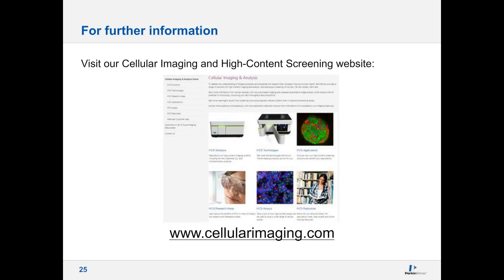Thanks, Christina. This is Joe Trask speaking, and I'll take that question on. I'd first like to say that at last week's SBI2 meeting, Society for Biomolecular Imaging and Informatics meeting in Boston, there was a 3D colloquium to really talk about some of the challenges with 3D imaging. Of course, as Jakob pointed out, light is the main thing. So getting good light penetration into the tissue so we can actually detect it is a challenge. And so it really comes down to the size of the spheroids or the tissue that you may be looking at, and how far light can penetrate into the tissue and then be detected.